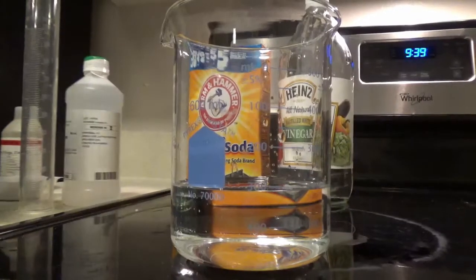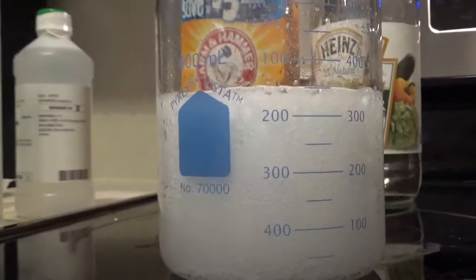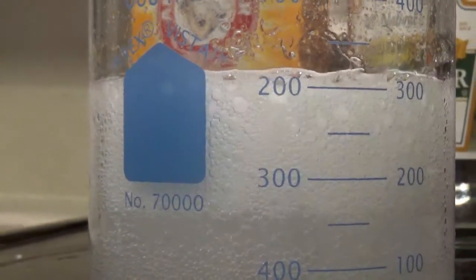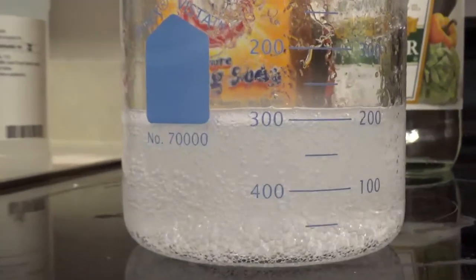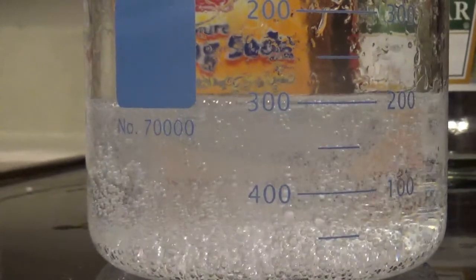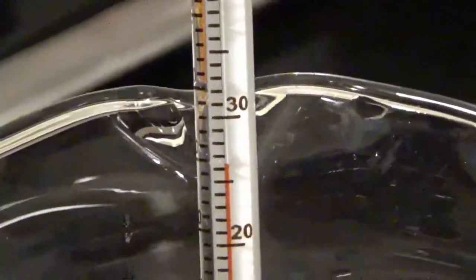For my next experiment, I took the temperature before, which was about 22 degrees Celsius. I took acetic acid, also known as vinegar, and added baking soda to it. It caused the clear, translucent liquid to start bubbling and release gas. As I let it simmer down, it still was releasing gas, and ultimately ended up stop fizzing. Afterwards, I took the temperature, and it had decreased by at least one degree Celsius.